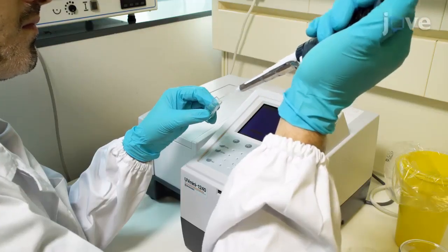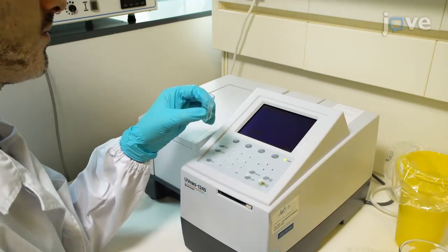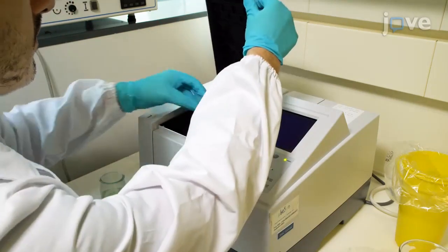These protocols that we develop are important to study the secretion mechanisms in cyanobacteria and their released products, namely the extracellular carbohydrate polymers and proteins. The knowledge generated will allow us to customize these products for several applications, namely biotechnological and biomedical applications.